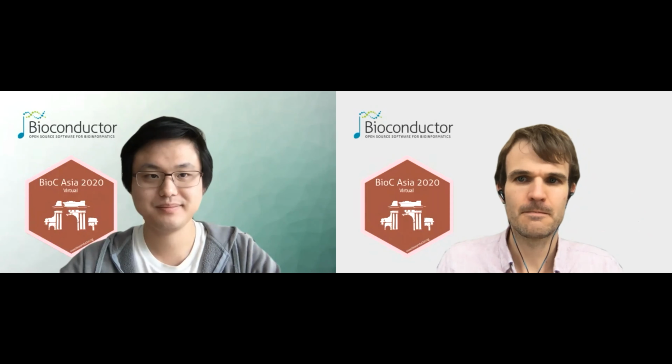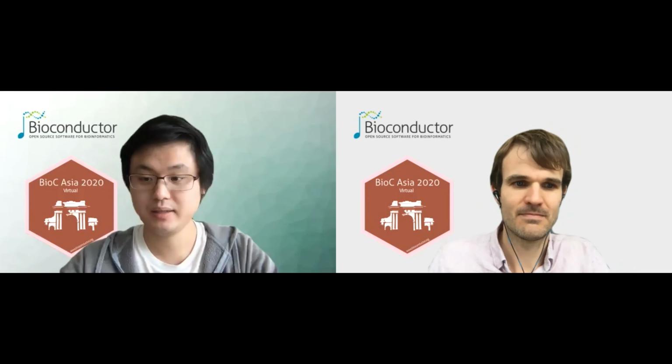It's a question from Al. Thanks, Shian. Do you think these can also be used for single cell NMT-seq data? What's the N? Is it nucleosome, methylation, and transcriptome-seq? I'm not familiar with that type of data, but I will go read up on it after this. If it's applicable, I would definitely like to support that as well.